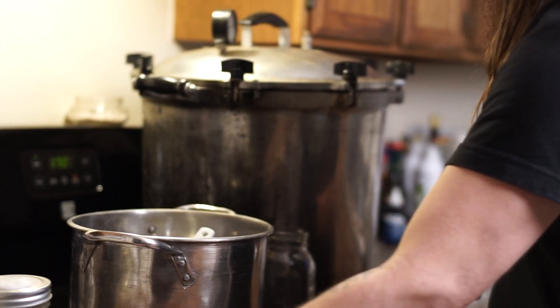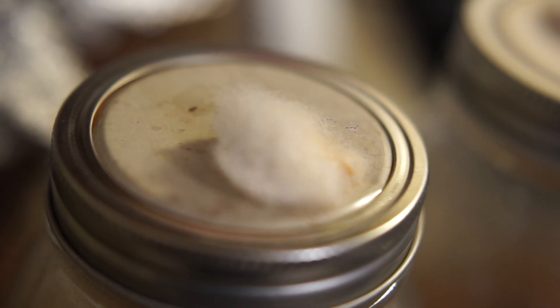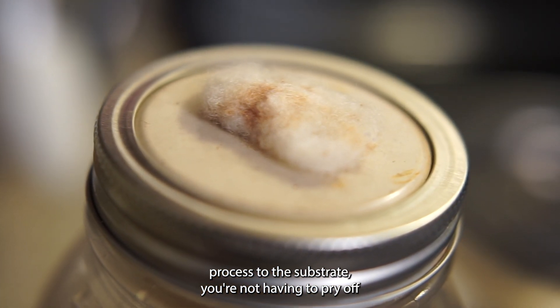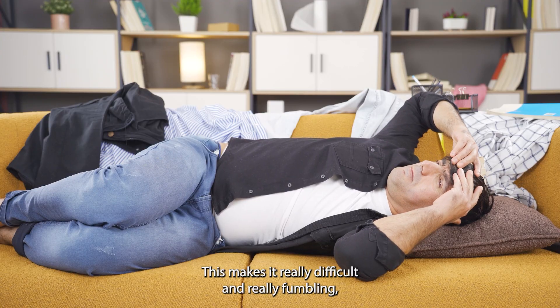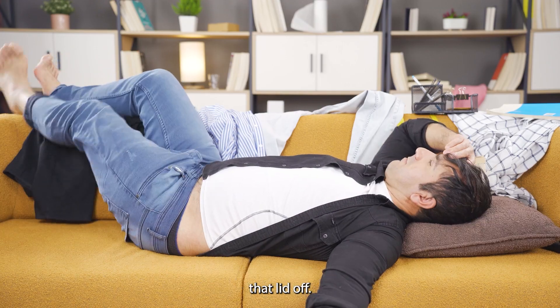A note on the lids: I have my lids flipped upside down. This is so that when you go to do the actual spawning process to the substrate, you're not prying off something that has essentially pressure-canned itself to the jar, which makes it very difficult, fumbly, and could potentially cause contamination.